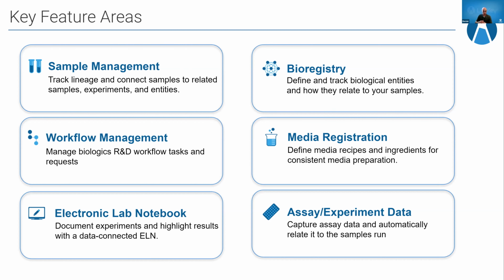We also offer comprehensive training on the way that all of our products work. So we can define how each of your different types of scientists or administrators are going to make use of the system, prepare each of them, and implement each of those as we go along.